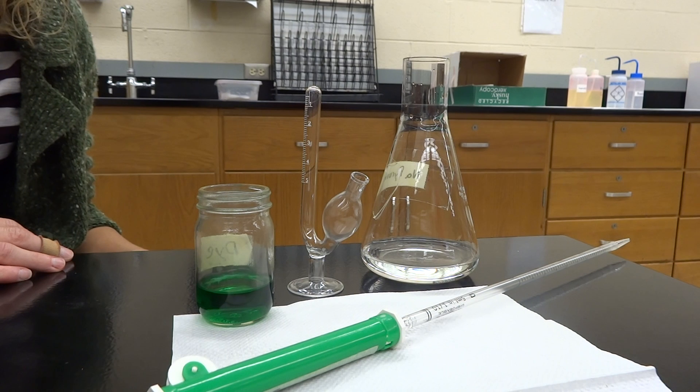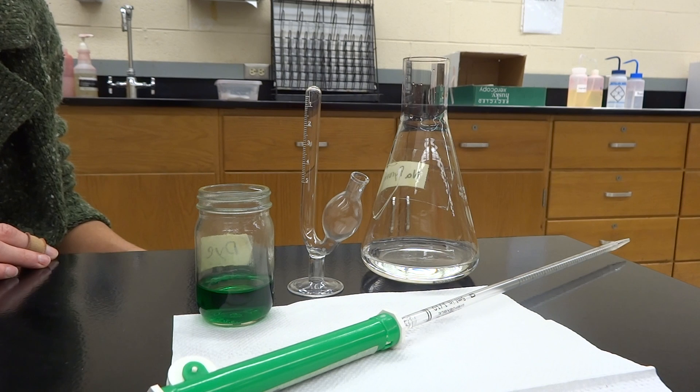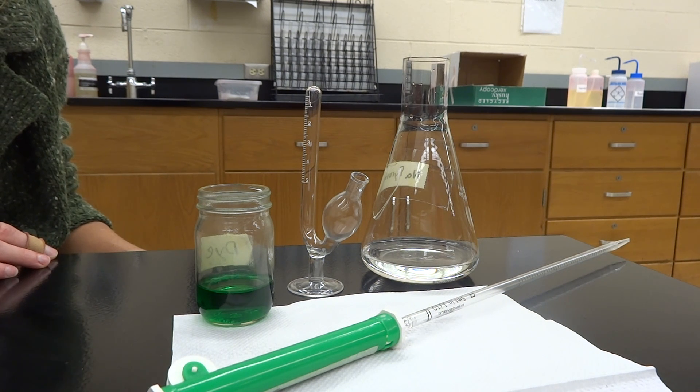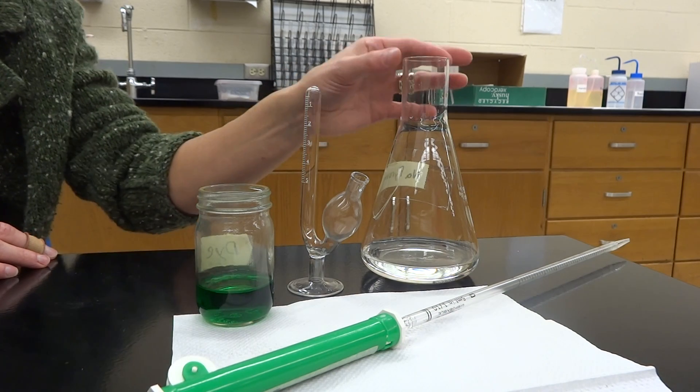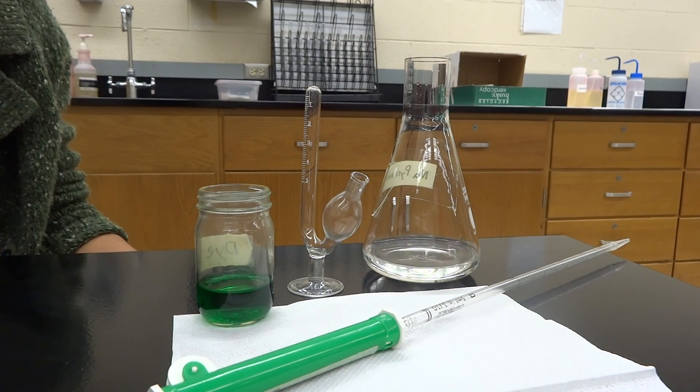For the fermentation experiment, we're going to be looking at yeast and how yeast is going to be producing carbon dioxide. It's going to be using the sugar that we give it, hopefully, in order to produce more and more carbon dioxide, just like yeast would be used to make bread and beer.